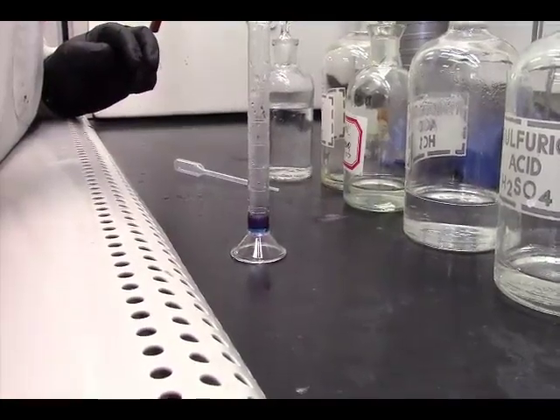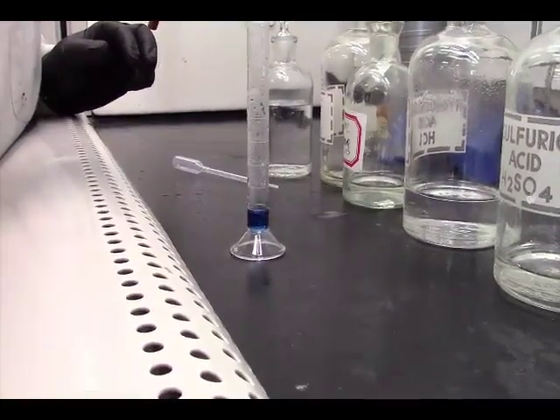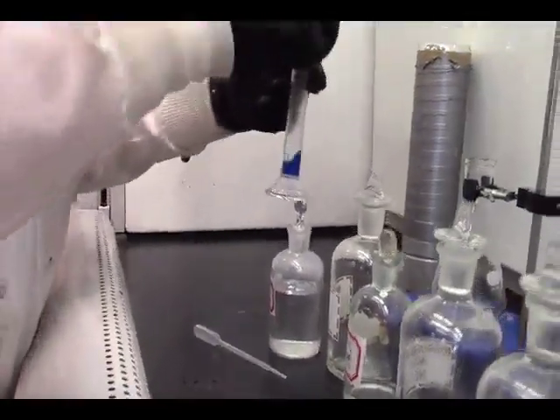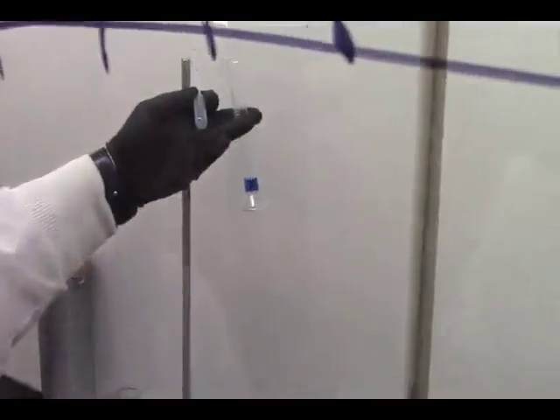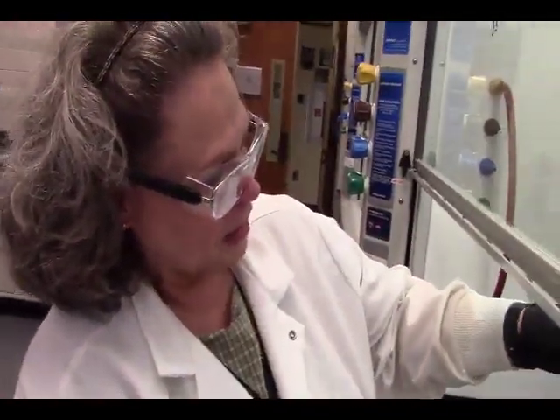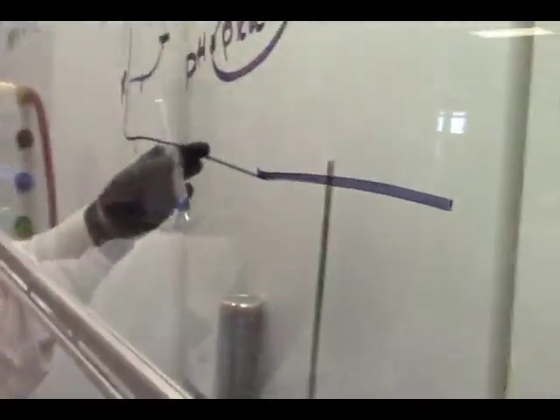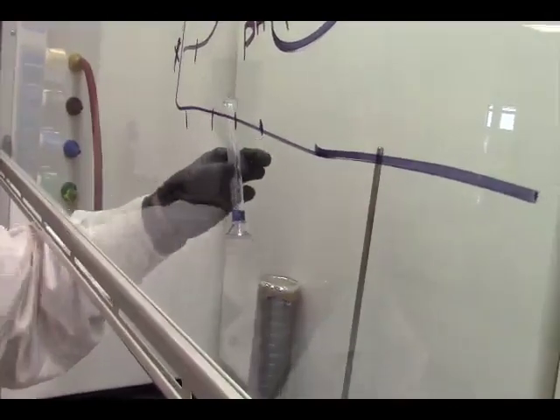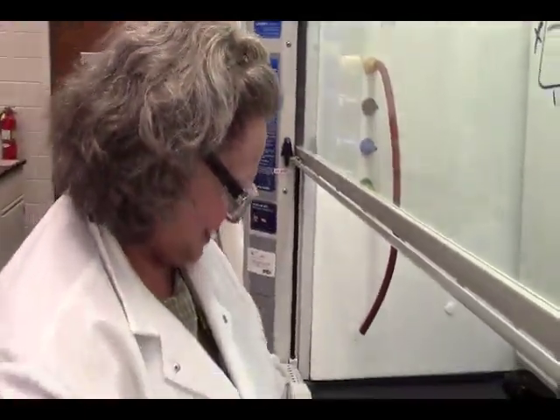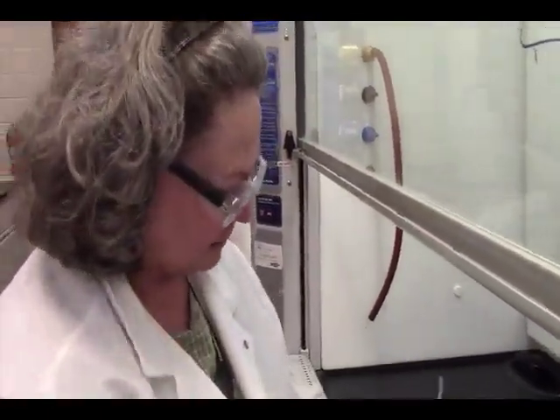Woo! Isn't that pretty? That's where they get cobalt blue from, because cobalt makes that pretty blue color. So this is actually cobaltous chloride with only chloride ligands on it, and you've still got some water around that chloride that's pink. Should we take a UV of this? Yeah, sure, let's do this. We're altering our procedure as we go. Yay!